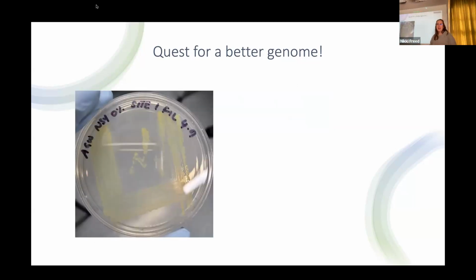And this is where Millie, Esme, and Sophie really stepped up, and we went out and got some new samples. We collected from 3 representative samples across the estuary this time, from site 1, 5, and 9. And Esme and Sophie cultivated about 650 isolates across as many plates. So it was a really big project, and we had a lot going on.